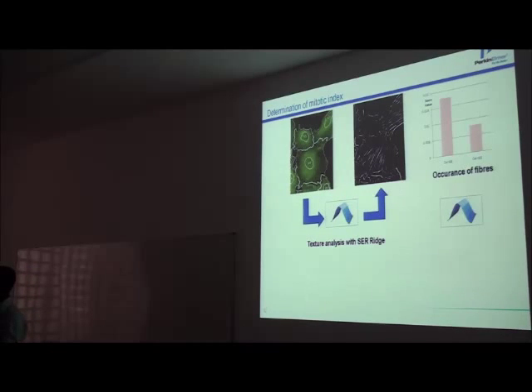to think about the plate level, where you have, for instance, let's say 100,000 cells. So you really need to have a very good window between the positive and negative. Right? So if all the applications where intensity is not changing, morphology is not really changing, but you see a new distribution or new phenotype, this will happen.